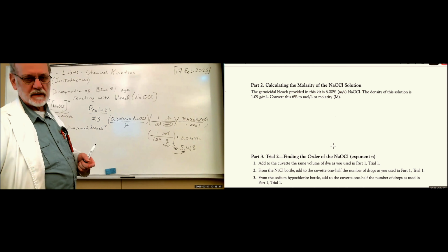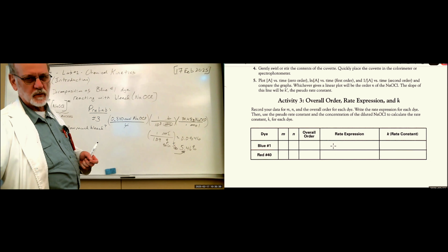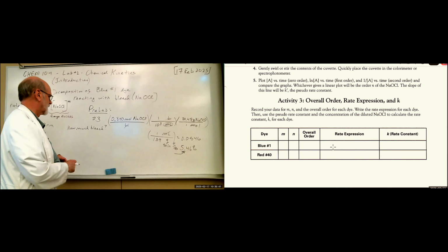Oh, a word about why we can use absorbance. What does absorbance mean? Okay, what we're referencing here is the Beer-Lambert law.